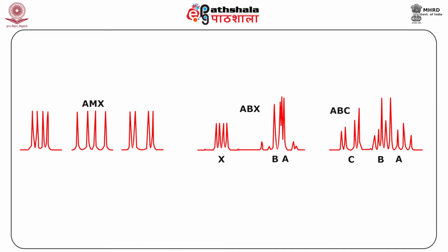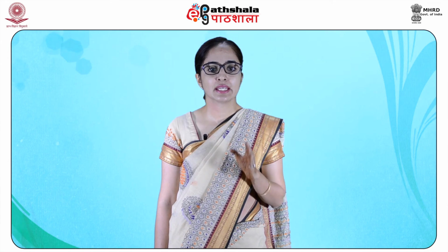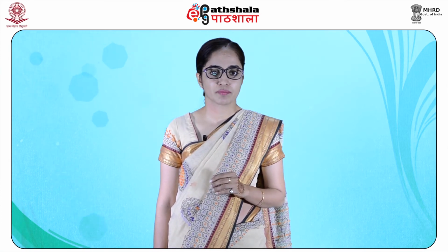The trans coupling JMX is larger than the cis coupling JAX. JAM is the geminal coupling with a significant value. The AMX system exhibits 12 lines of almost equal intensity.